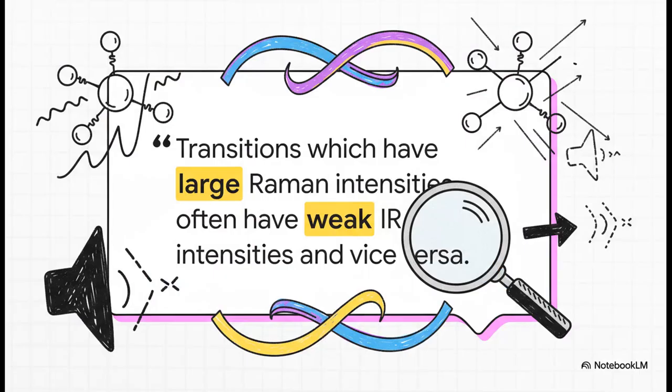This quote just sums it up perfectly. What it's really saying is that these two techniques are like two sides of the same coin. A vibration that's screamingly obvious in a Raman spectrum might be completely invisible to IR, and the other way around is true too. They don't compete with each other, they complete the picture.